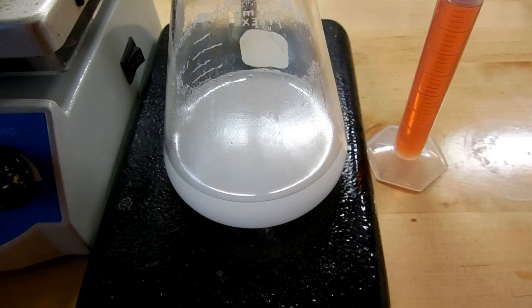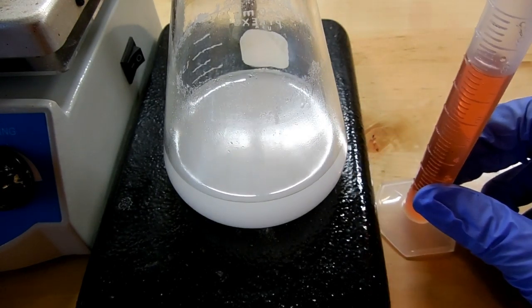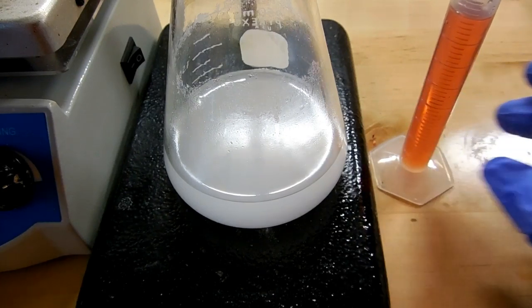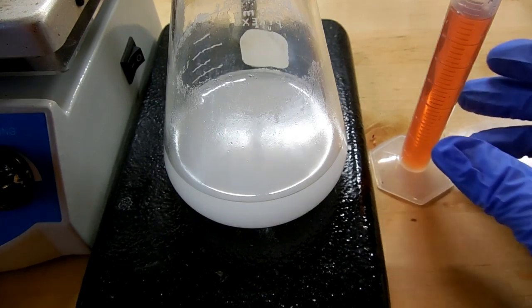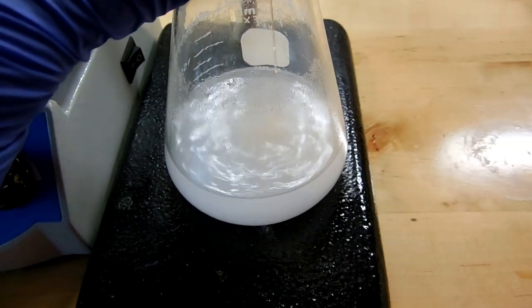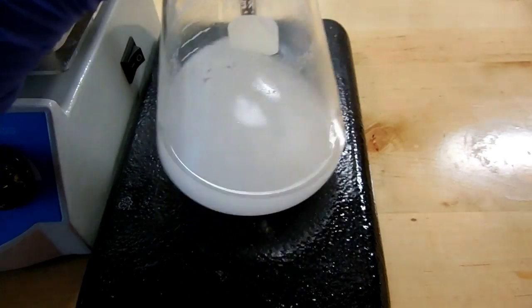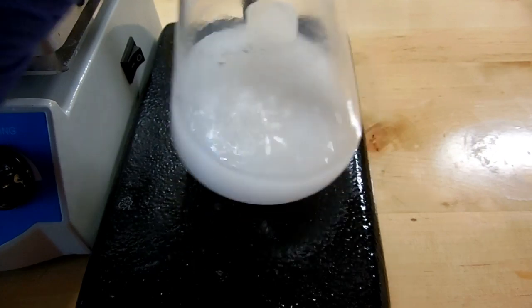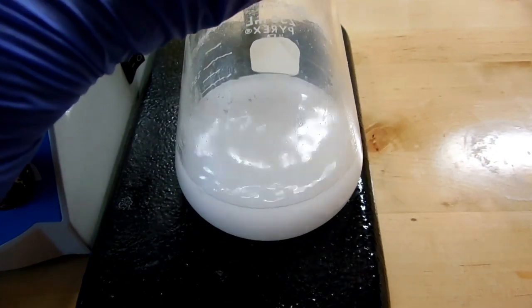Now we need to add a catalyst to help the reaction along and that is concentrated sulfuric acid. I will add 8 milliliters of that to the reaction flask very slowly because it produces quite a bit of heat. So I'll add just a little bit at a time, swirl to mix and add a little bit more.